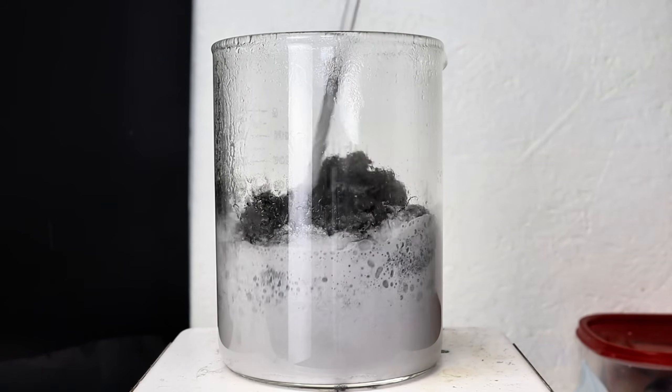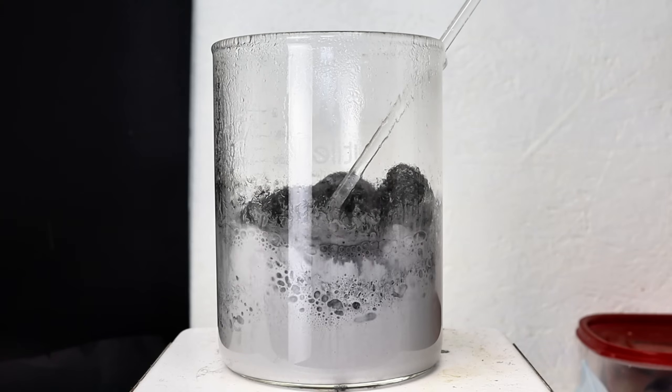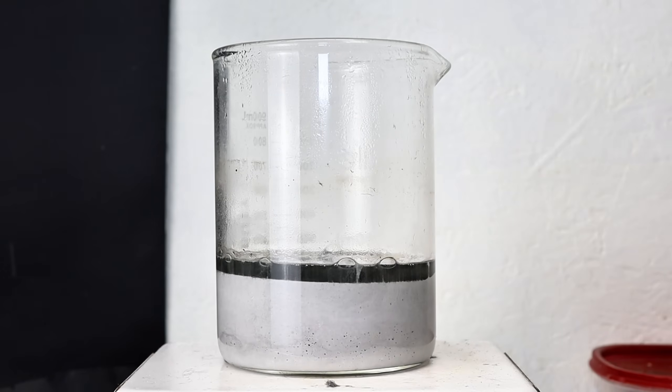To be fair, any chromium present would probably be removed when this crystallizes, but ideally you just want to take it out of the equation entirely. Anyway, I kept adding steel wool and water until no more dissolved, and this eventually left me with a beaker containing a thick white layer of salt under a dark layer of liquid.